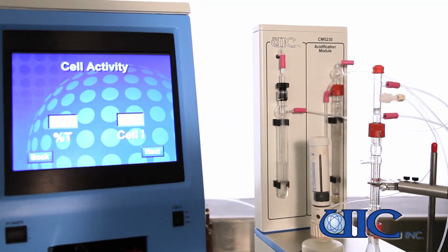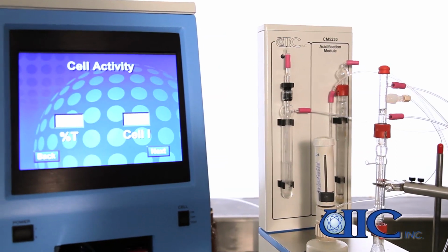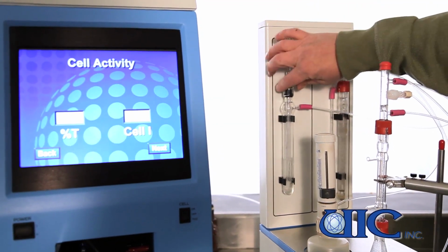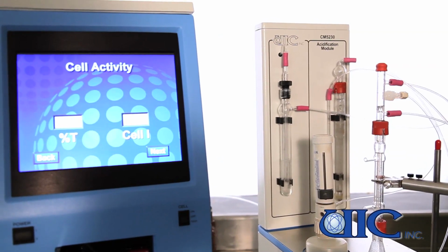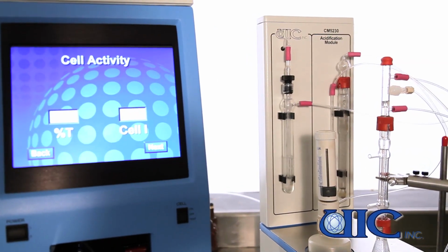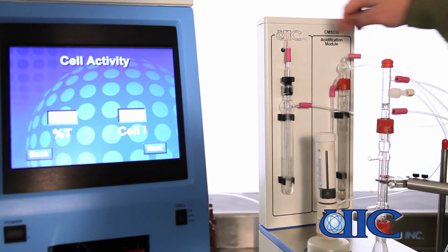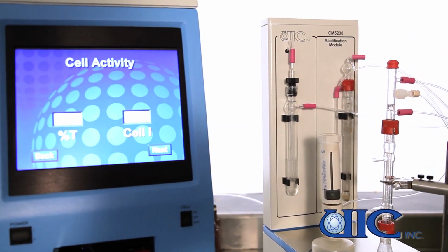The acidification module contains an internal pump that pumps atmospheric air to use as our carrier gas. At first, the air will pump through a pre-scrubber that contains a KOH solution. The KOH solution, of course, removes any atmospheric CO2 from the carrier gas, and we have a nice clean carrier gas that we can use for our analyses. The air pumps into the KOH scrubber, out, and then into the top of the sample column adapter.